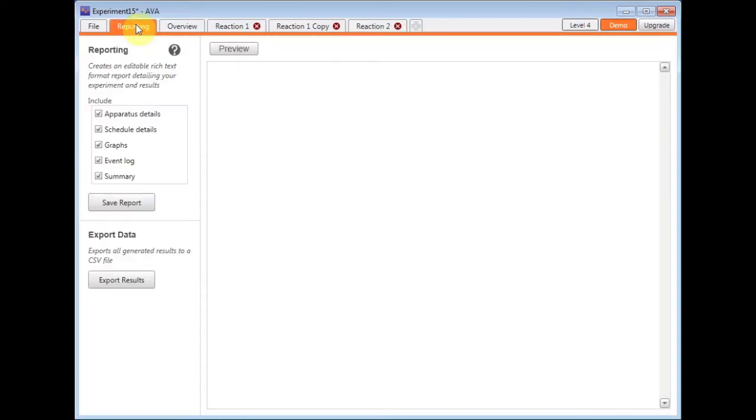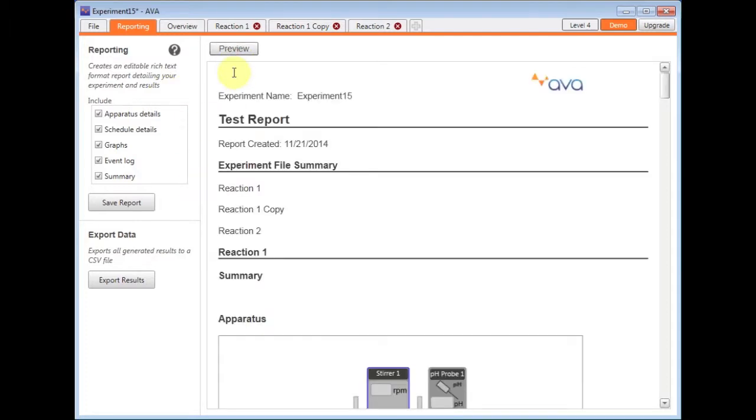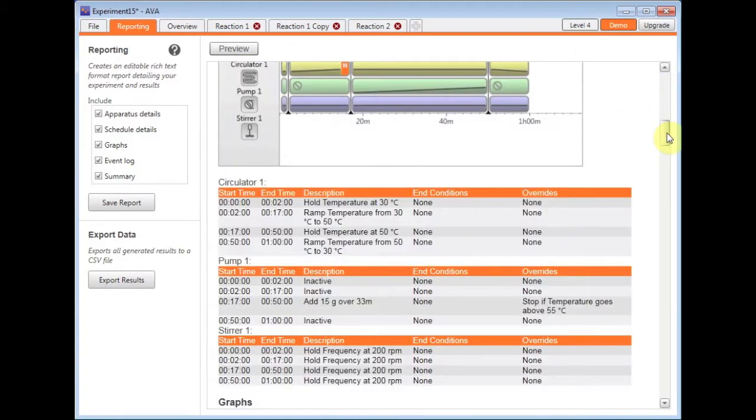The reporting tab enables you two export options. One which, if I click the preview, is a Word document and this shows you all of what would be included in that for me.